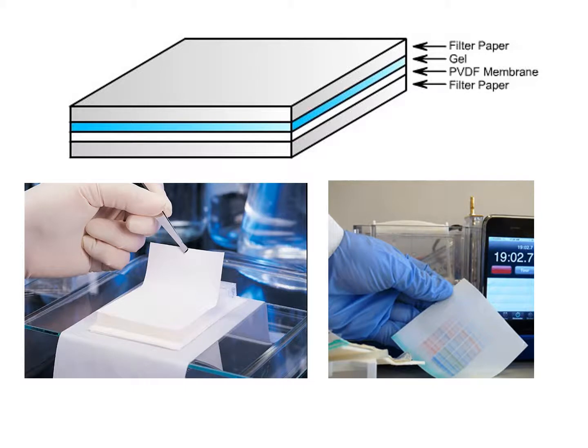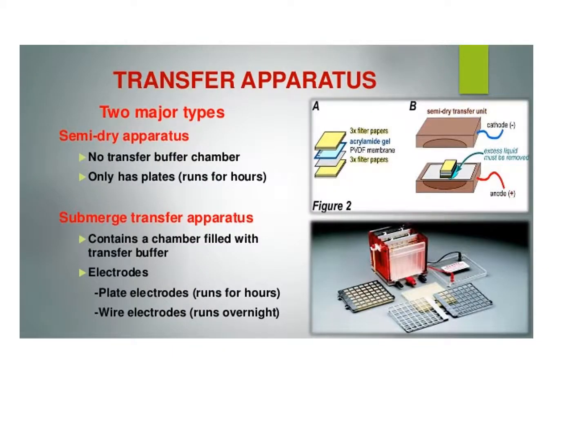And so here's just another picture of the cassette, the sandwich. This guy's got some forceps. Here's some pre-stained standards, or that he's just showing that it worked there. So, okay, that's him putting it on the gel and then after transfer. Okay, here's the transfer apparatus.